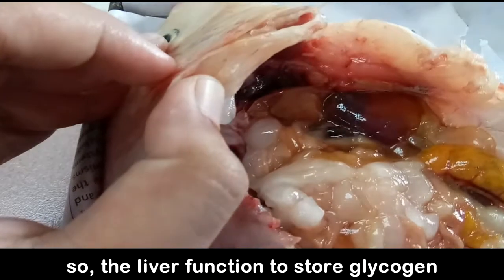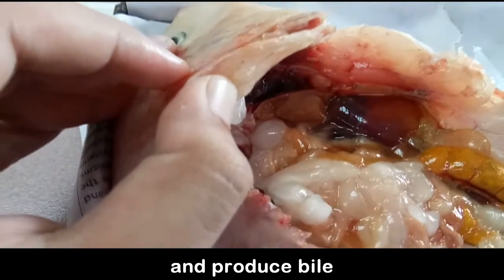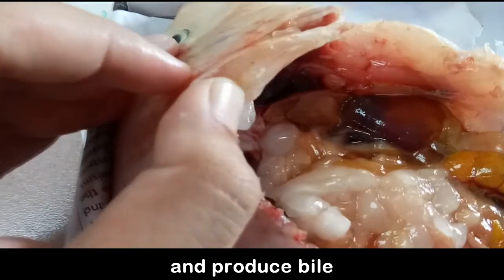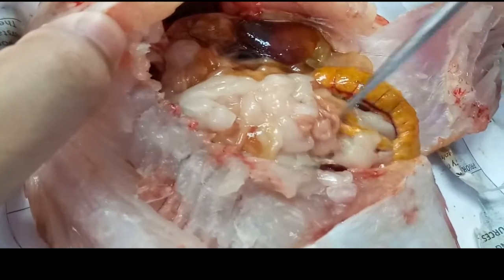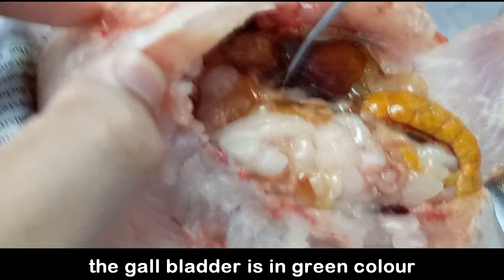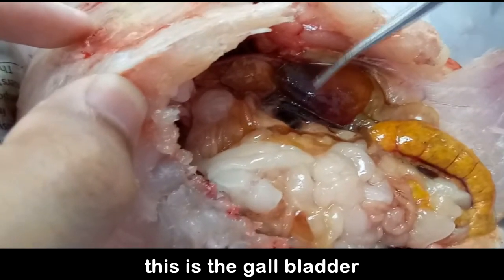So the liver functions to store the glycogens and to produce bile. The seventh internal organ is called the gallbladder. So we find the gallbladder here. The gallbladder is in green color, basically. Is it visible? Okay, this is the gallbladder.